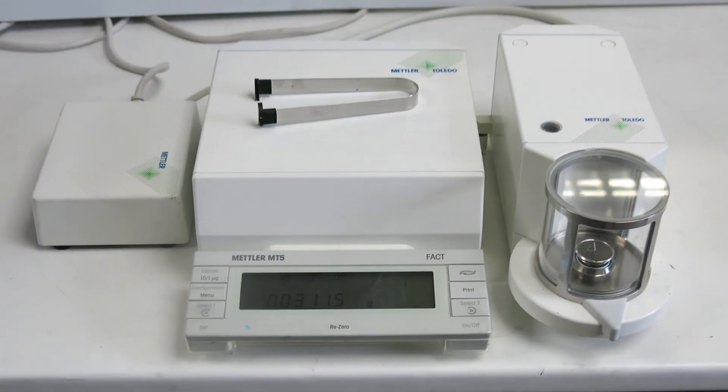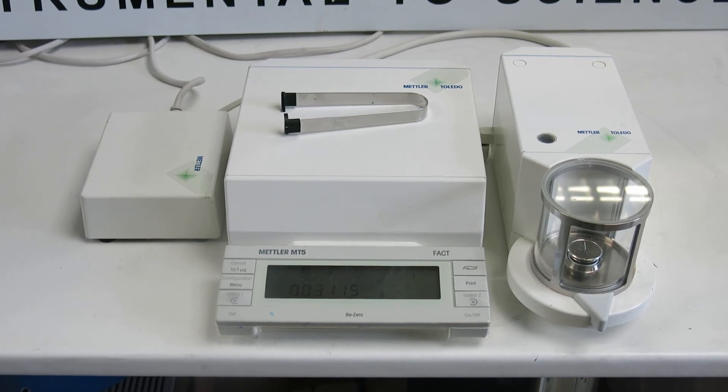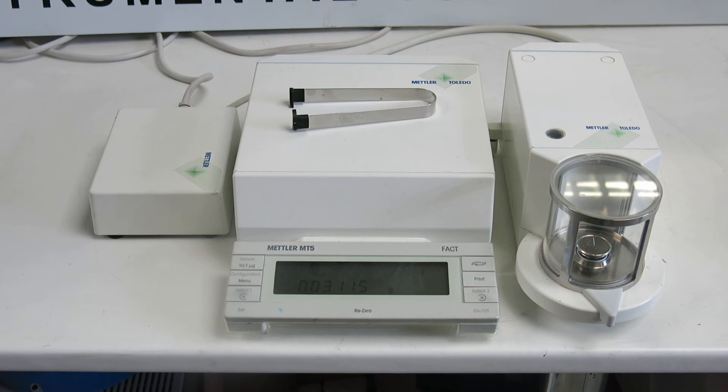The instrument is in good order, just been serviced, and is in really good condition as you can probably see from the image there. Thanks for viewing, and if you have any questions, please call Nick at Richmond Scientific. Cheers.